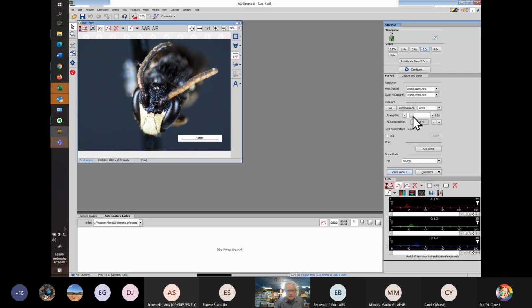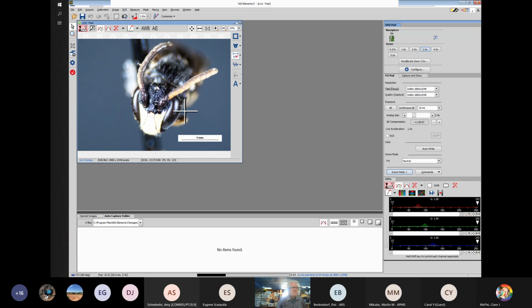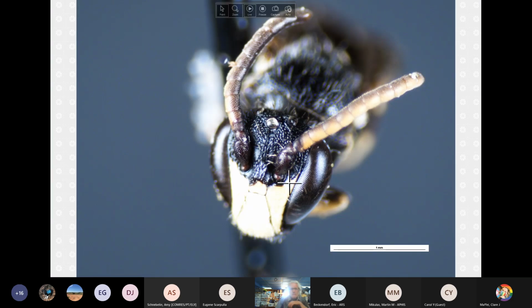So you can see what's going on in the scape. I believe it's slightly swollen. So let's take a look now that we have done that. So yeah, at minimum, the scape is quite different, more turgid. There's no concave outer area.